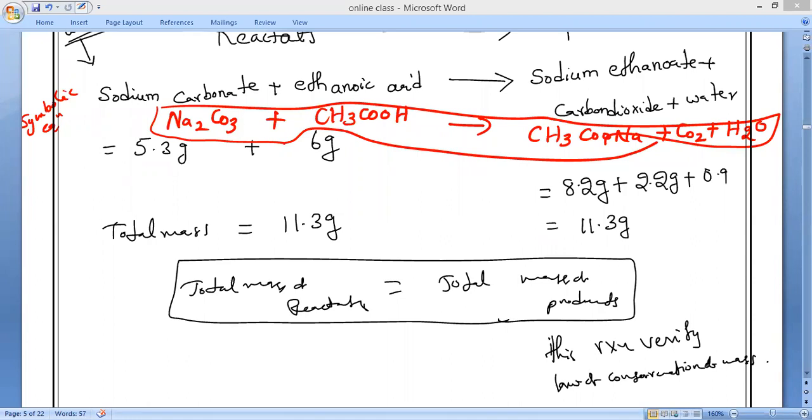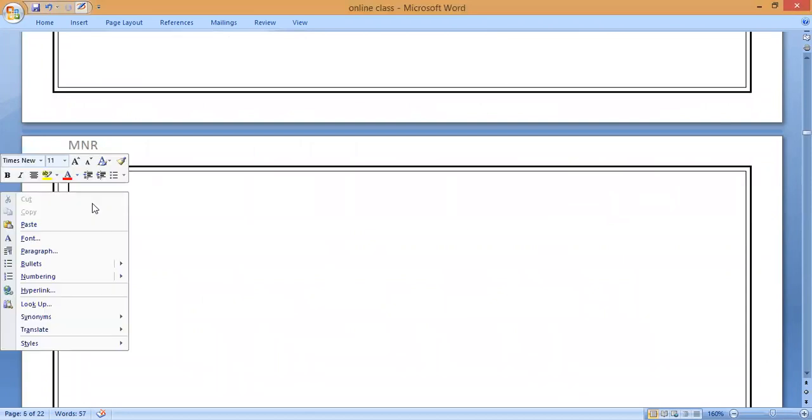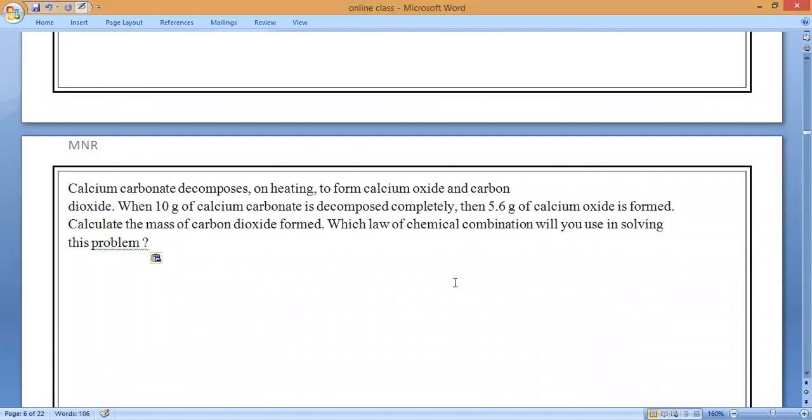Completed, guys? Yes, sir. Next. You should tell me whether it is verified or not. Quickly. Verification has been done by you people, and you should tell me whether it has been verified or not. This is one of the most important ones. How many of you solved your exercise? Mitakshri, have you solved your exercise? No, sir. The second exercise question is also similar to this. So let us solve this question, everybody. Let us see who will solve first.